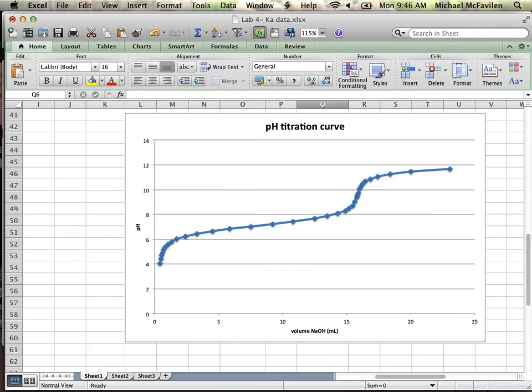And then what happens as our experiment goes? Slope picks up. So if we ignore again those first, how many data points did you take at first? Like 10 data points, we can ignore those. We can take a look at our slopes. We would expect a relatively small slope, something very close to zero, followed by a spike.